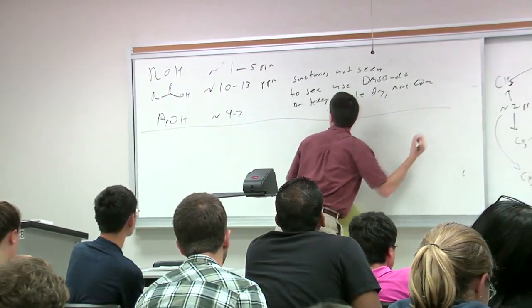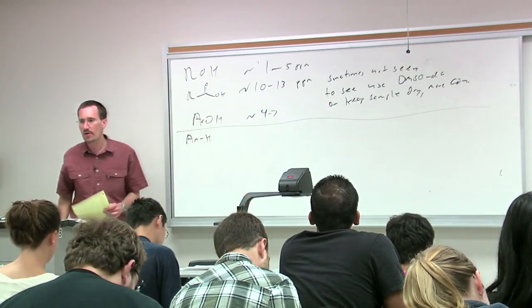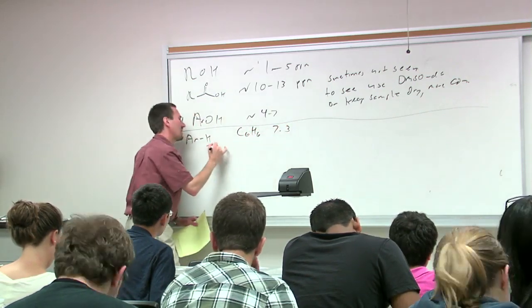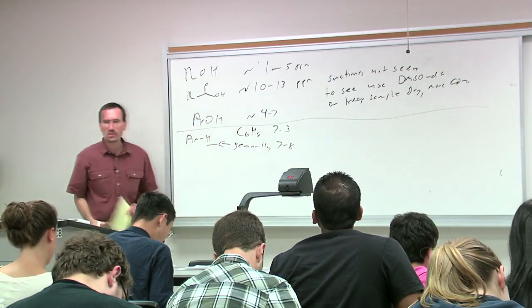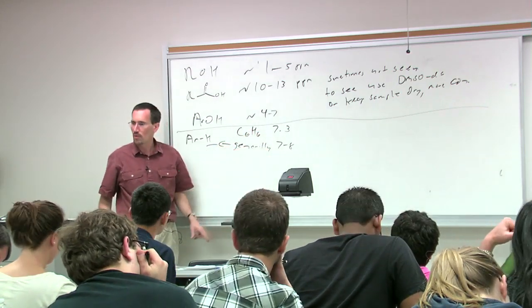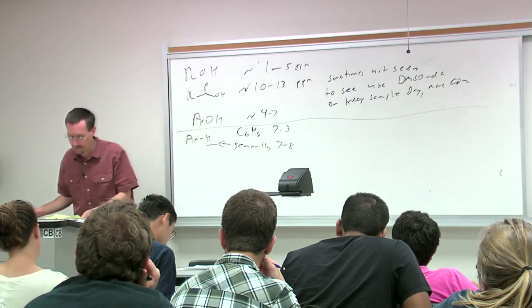All right, aromatics in general, I think everyone knows that aromatic protons appear downfield. So if you have ArH, meaning an arene, a benzene, a thiophene, a pyridine, benzene itself, C6H6, is at 7.3. Here we're talking generally 7 to 8, but these ranges are loose. Electron withdrawing groups will bring you further downfield. Electron donating groups will bring you upfield. I can show you aromatic protons that occur at the low 6 ppm numbers. I can show you aromatic protons that appear at 9 ppm.